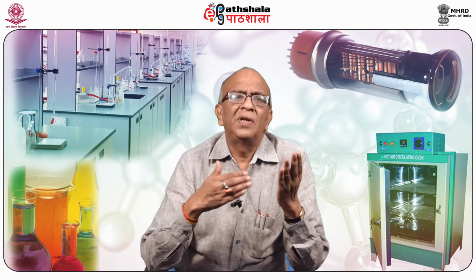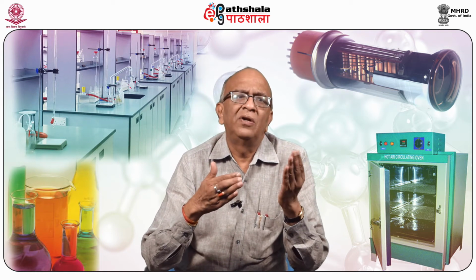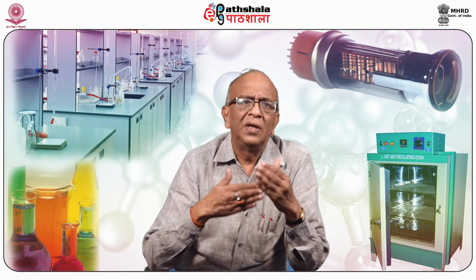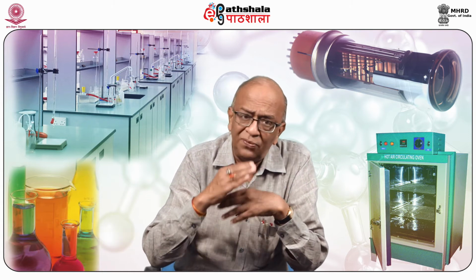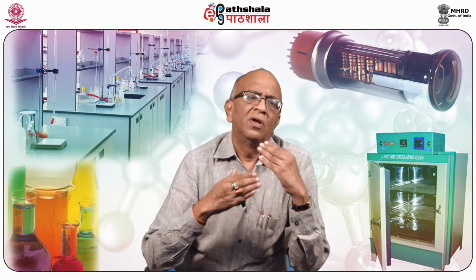Here, if we take the equation, the partition coefficient is based upon the concentration of the solute in the stationary phase and the concentration of the solute in the mobile phase, and their separation is dependent on the partition or distribution coefficient.